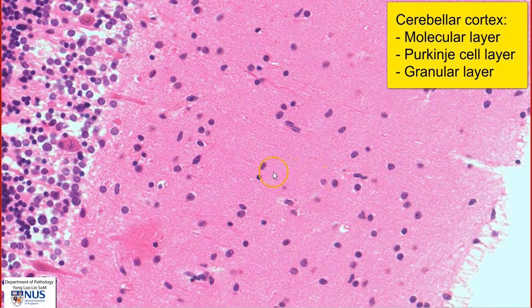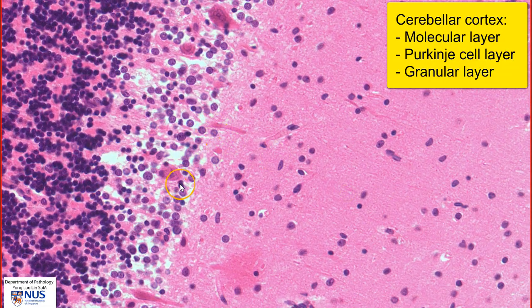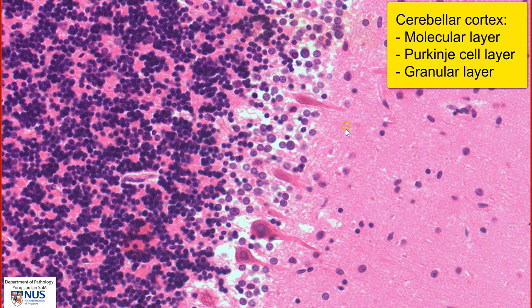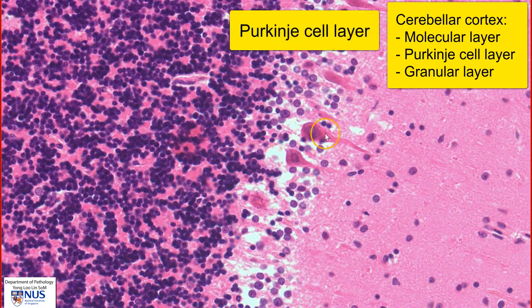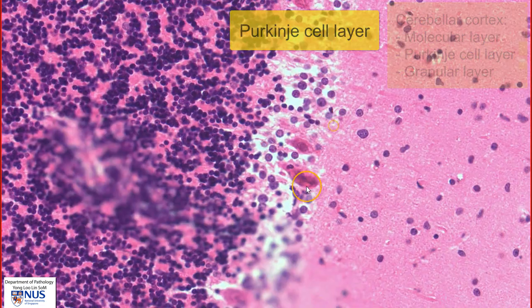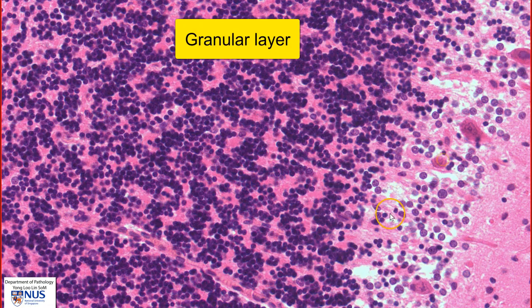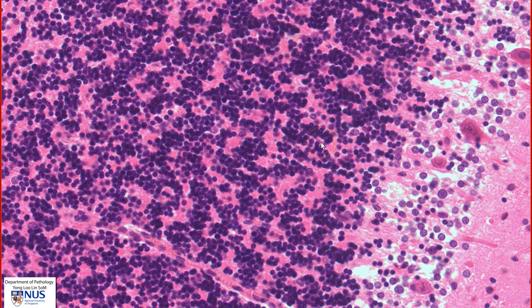In the molecular layer, we see mostly the dendritic processes of these Purkinje cells and some interneuronal cells. In the Purkinje area, we can see these large neurons with their dendritic processes joining up with the molecular layer. And finally, the granular layer, which is composed of these very uniform, round, blue-looking cells with minimal cytoplasm.